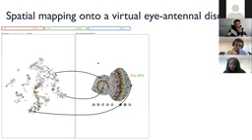So now, because these clusters represent this spatial organization so well, we could actually draw a virtual template, a virtual tissue, and then place the centroids of all these clusters into that tissue, and then project all the cells in there while preserving the distances between these cells.